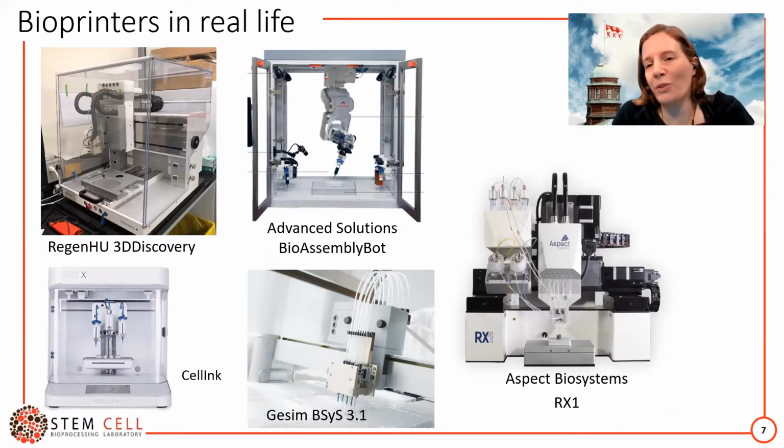I don't know if some of you have seen Westworld. That's the kind of 3D printer they're envisioning in that show. There's also a lot of other extrusion printers that are a little bit lower end that are available on campus, but these are very convenient because you can place them easily into a biosafety cabinet, and they're great for rapid prototyping.